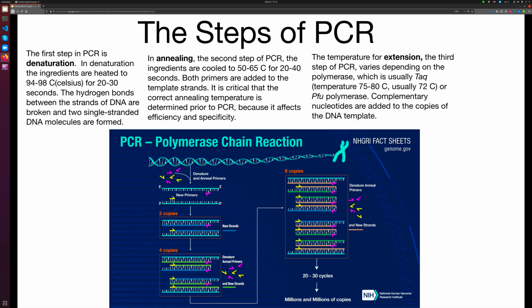So you can see right next to the X, there's this double helix. And this double helix is normally how DNA is made. So DNA is normally in this double helix form. But you can't use that double helix to copy DNA through PCR. So first, you need to have an initial denaturation. This initial denaturation unwinds the double helix.